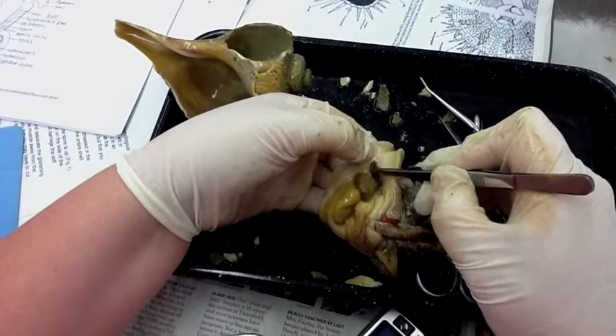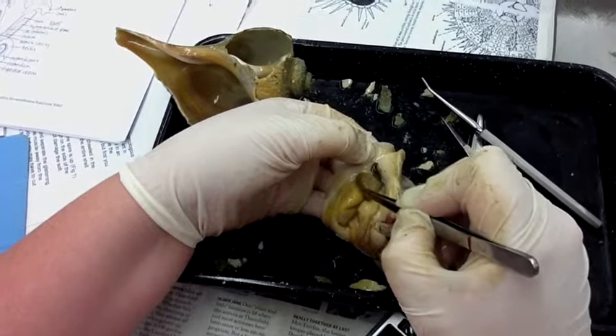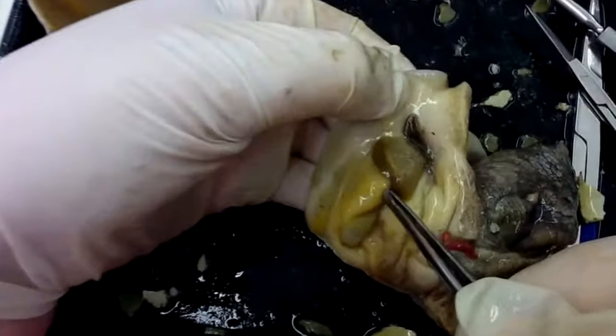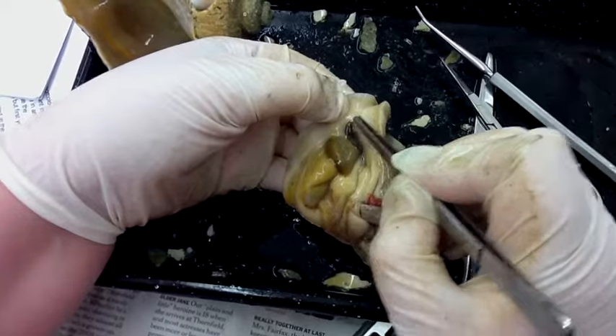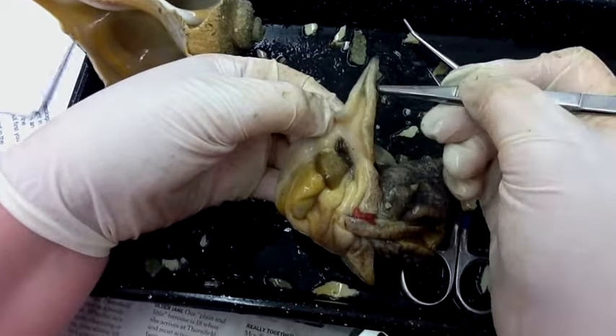The structure right here is the osphiridium gland next to the gills, and the hypobrachial gland behind it is this dark brown structure right here. The osphiridium organ is a sensory organ located in the mantle cavity next to the gills, and here is the siphon.